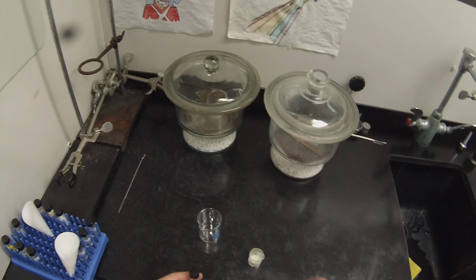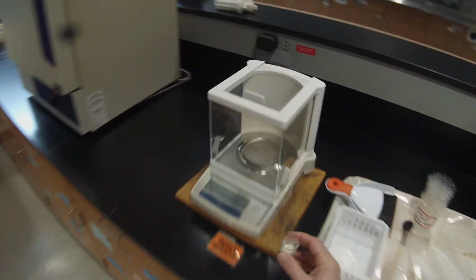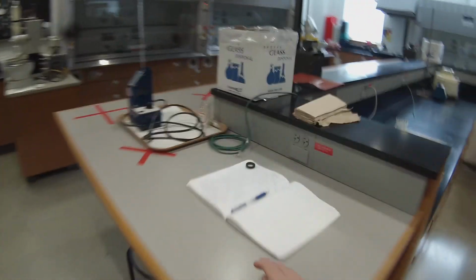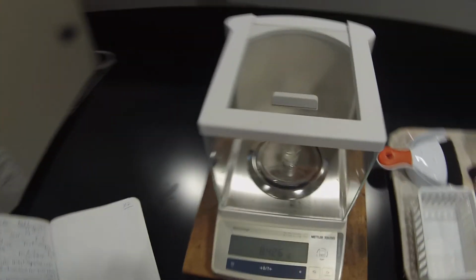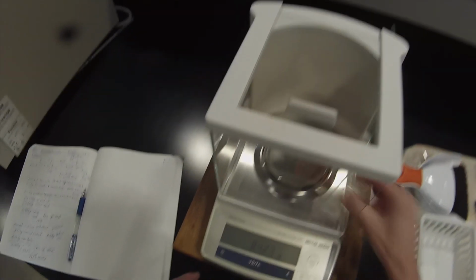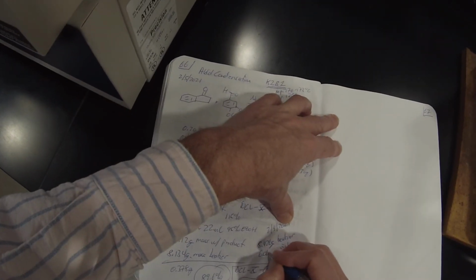So we're going to get a mass of the beaker and a mass of the vial, and then we're going to transfer that compound and also get an IR. Grab my notebook, write these down. That beaker is 8.426 grams. And the vial that I'm going to transfer to looks like 6.068 grams. So the beaker went from 8.512 to 8.426, so we lost some of that water mass.